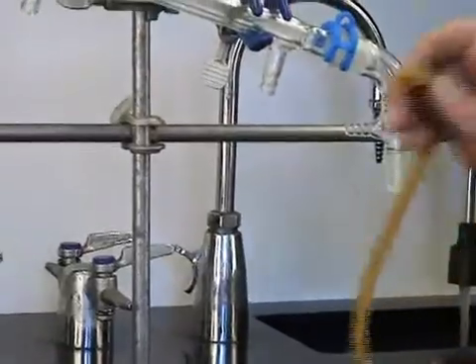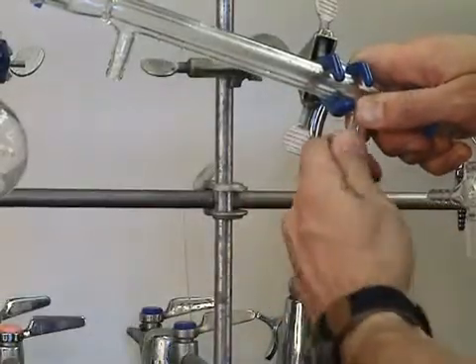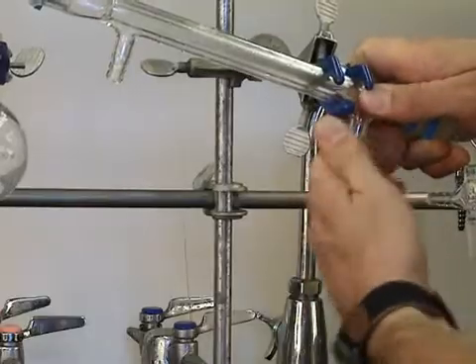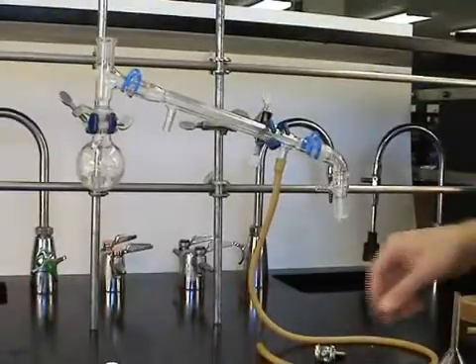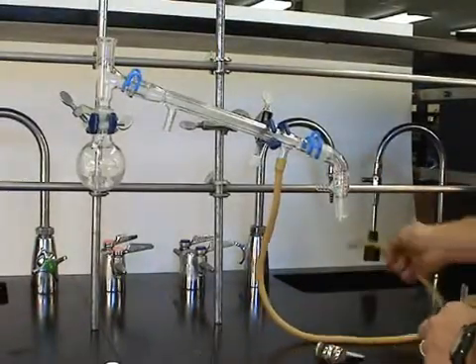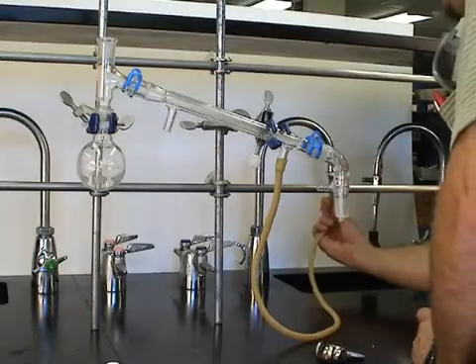Take a piece of latex tubing and wet it with a little bit of water, and slide it up over the tubulature. The lower end of the condenser gets attached to the cold water tap.